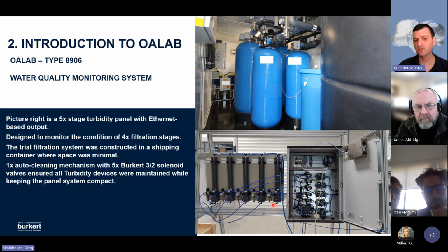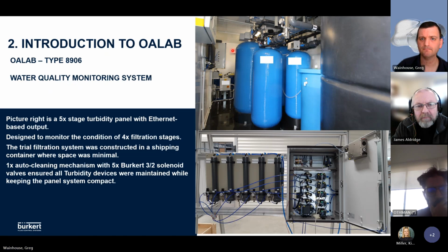And we also provided all the bubble traps as well, because bubbles can refract the light source and give false readings. So we have to remove all the bubbles from the water, and that's what those bubble traps are for. Then we pre-mounted all those for the customer as well, so they can just put it in the cabinet in a nice neat format, so you can just see it tucked up on the left hand side of the top picture there.